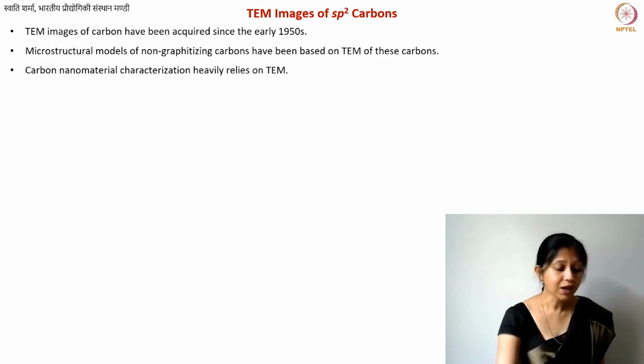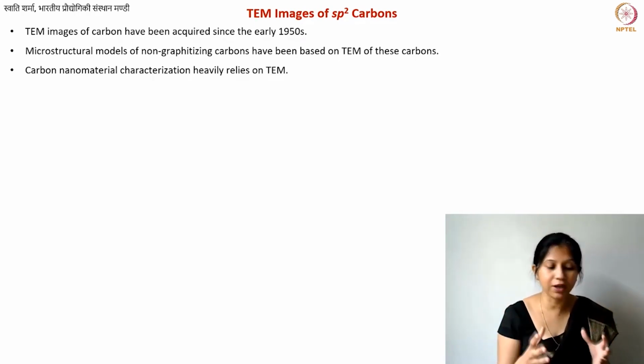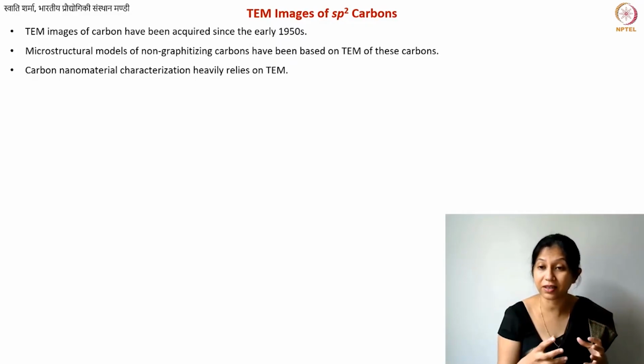Okay, carbon nanomaterials. I told you, you've never seen a carbon nanotube. You only believe in what you see inside the TEM. Not just carbon nanotubes, but there are also carbon nanoparticles, various carbon nanomaterials. And in fact, some fancy carbon materials, fullerenes. Fullerenes we know, and we know about them also chemically using chemical synthesis, and we also know how they agglomerate and form an FCC crystal and so on.